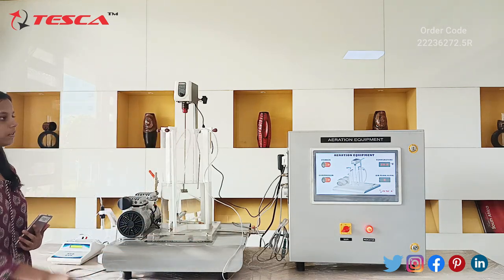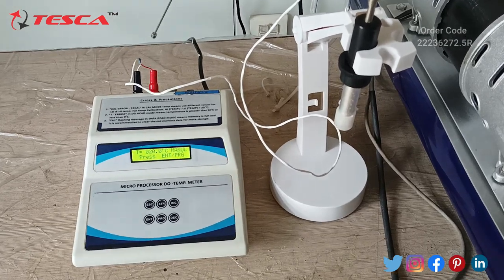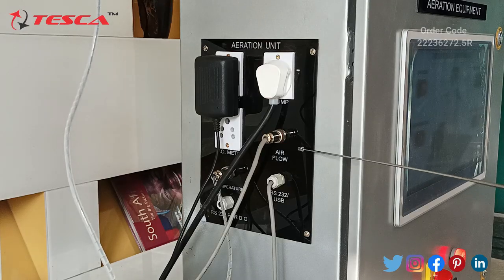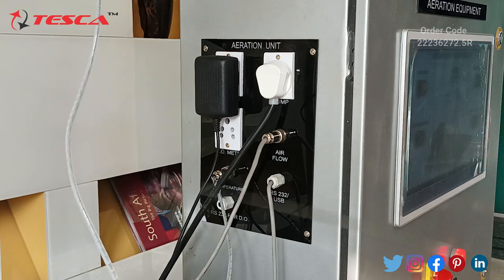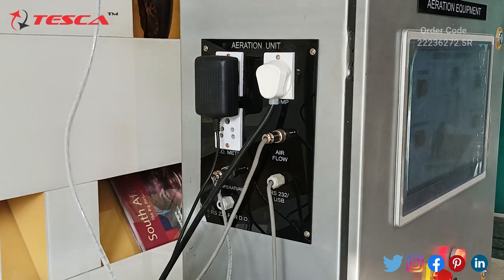You can see this is our DO temperature meter. We have to connect the red probe with the red connection and the black probe with the black connection. For the air flow, you should connect the air flow probe here only. These are the other connections: temperature, DO meter, aeration, control unit of the stirrer motor, and pump. You should connect all these connections here only.